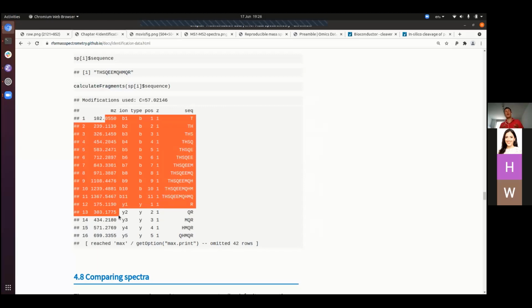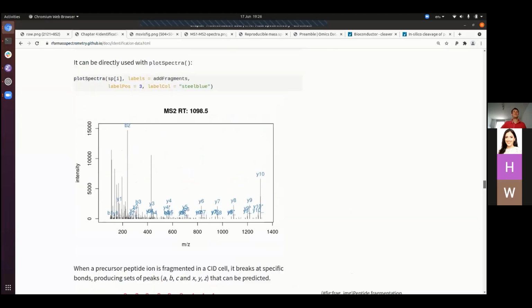Well, these would come from all possible peptides that we will expect to see for a specific sample of interest. And then all the observed M over Z values, well, these are the M over Z values of all the MS2 scans that were acquired during the experiment. And so I think I have a visualization here, for example. And this is also something that you can reproduce yourselves.